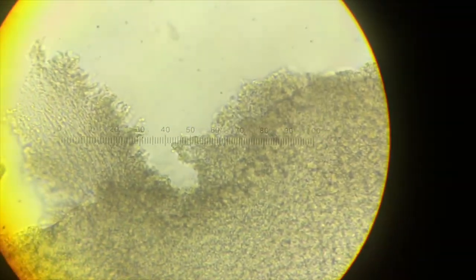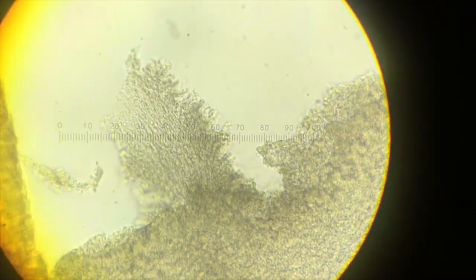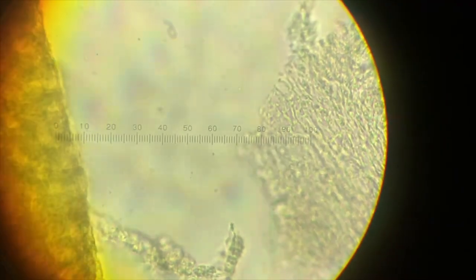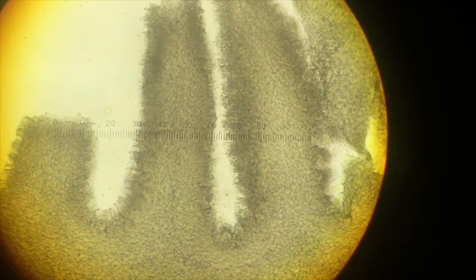Sometimes even these little pieces here show you what's possible if you go super thin, even though this is completely chopped off. It's too thin. And again, this has no real hydration. It has no staining. If the material that you're sectioning was decayed, started to decay, then it won't rehydrate properly either.